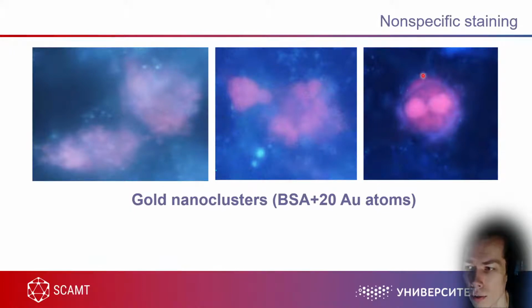And so we see no blue-colored exosomes or blue-colored late endosomes in this cytoplasm, only endosomes, or maybe not even endosomes, just some clusters in cytoplasm.